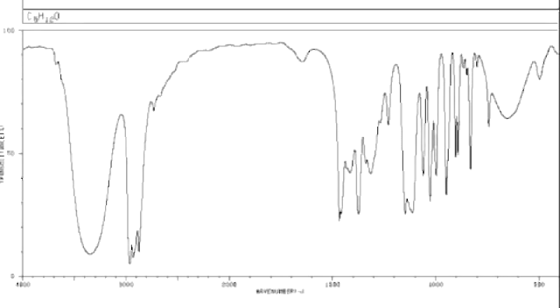Okay, so here we see an alcohol. Before we get too far into this, I suggest that as soon as I flash up a new molecule, like we went from the amine to the alcohol, you can stop the video and analyze the molecule on your own before listening to the way that I go through it. That might be a valuable way to use this video.